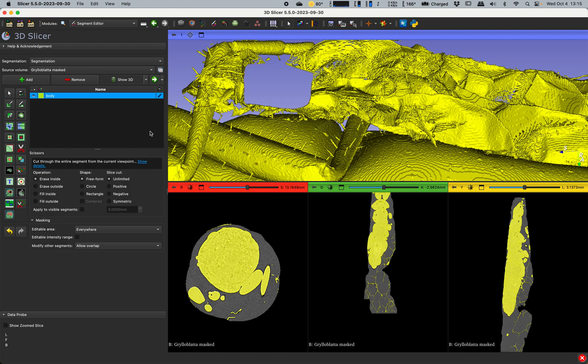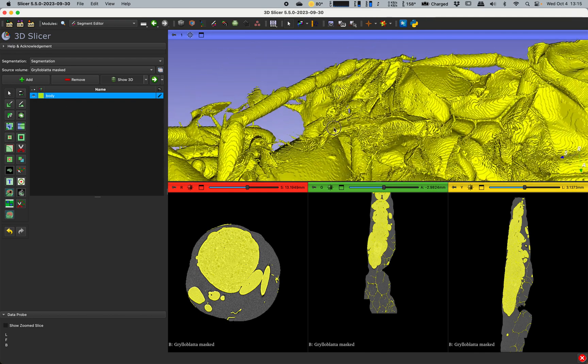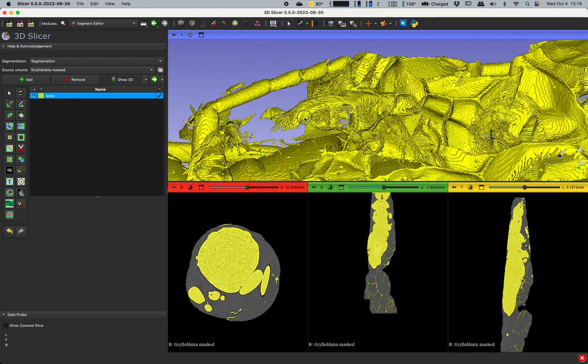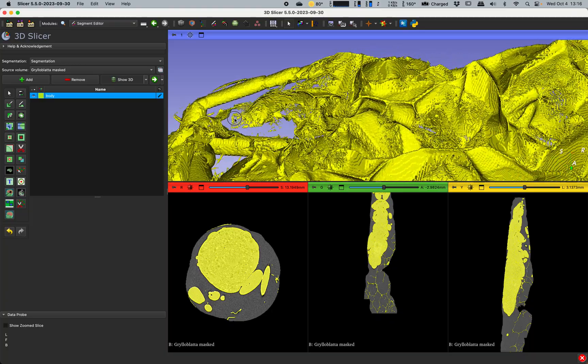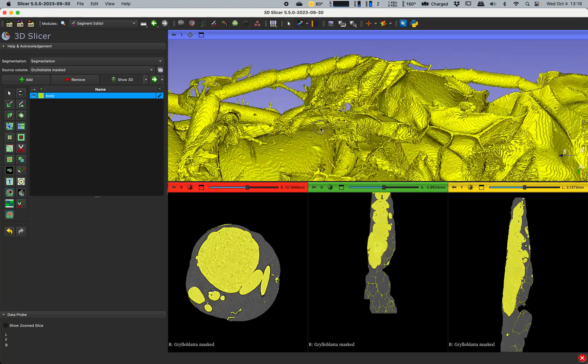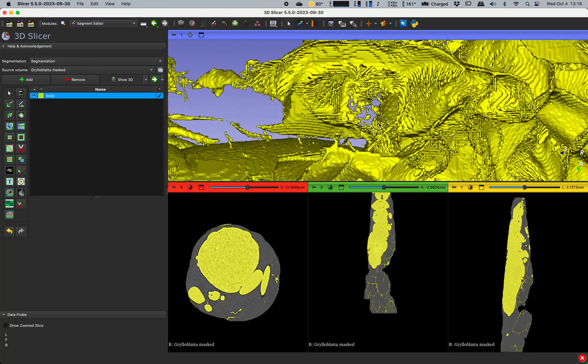And then as you can see, I'll go back to here so I can rotate around. It has cut out everything that I can see through there. So using a combination of rotating around and scaling in and so on and so forth.